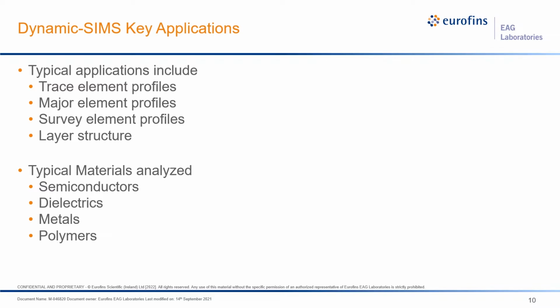SIMS technique was initially developed for isotope analysis of geological samples for aging studies. But as I said, back when Silicon Valley was growing, the semiconductor industry in the 60s necessitated SIMS analyses of dopants and impurities in these special semiconductor materials. And as these devices developed into multi-compositional layer stacks, SIMS analysis became more complex to include dielectrics, metals, and multi-layer stacks, which opened the doors to be used for all solid materials like polymers and bulk ceramics.